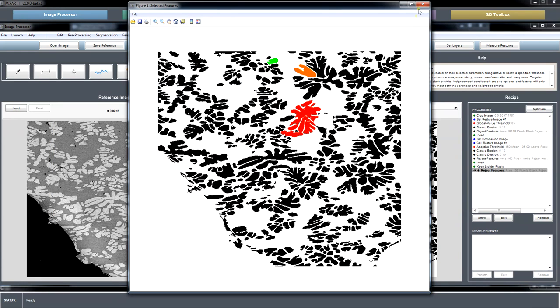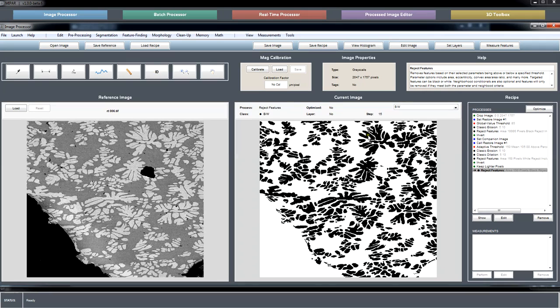If you just limit your selection to 2 features at a time, which is usually what we always use that tool for, is to compare one feature to another, then you won't have that issue with the measurements being off the window. But we'll fix that and make it scrollable. If you want to measure more than 1 feature, like we showed before, and I think Romulo, if you're still with us, this will maybe help with the automating ID. I'm not sure if it does automating ID for individual features. Let me know if this isn't quite what you had in mind.